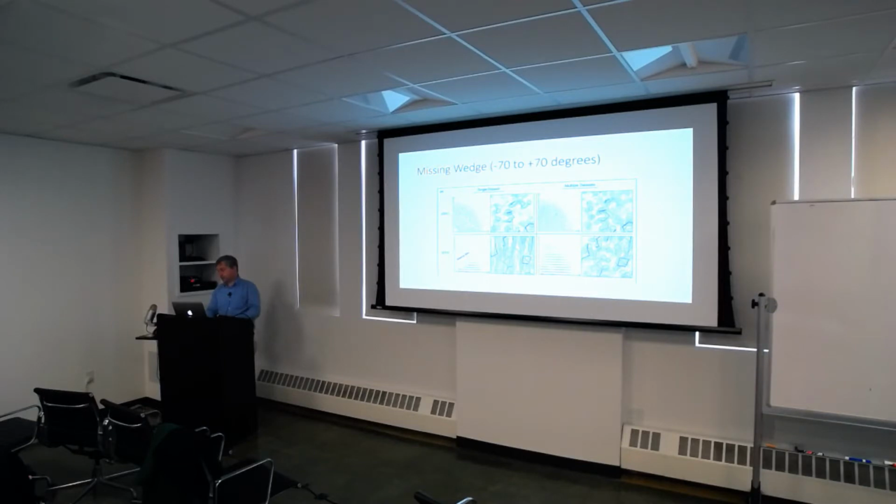So if your crystal is thin in only one dimension, so that it's super thin, but wide and flat, that would be a difficulty, because then it would not lie in the right way. So this is a similar problem with 2D crystallography, I guess? 2D crystallography also you can only tilt -70 to 70, yeah, but with 2D it's sort of worse because they only are 2D. They're not 3D crystals, so there can essentially be only one way they can be lying in the microscope.